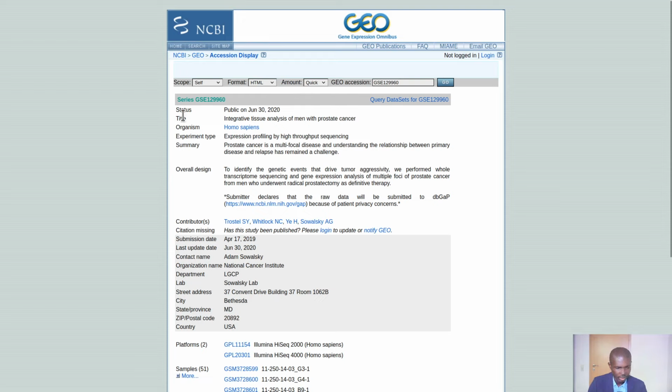You can have status, title, organism, which is important, experiment type, summary, overall design, and which can also be the title to a publication. We have contributors, and we also have the contacts, the contact person, okay, or corresponding author.